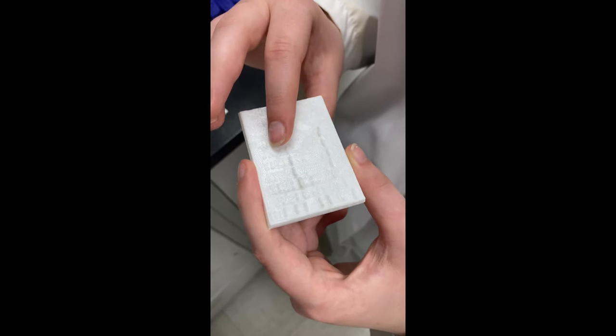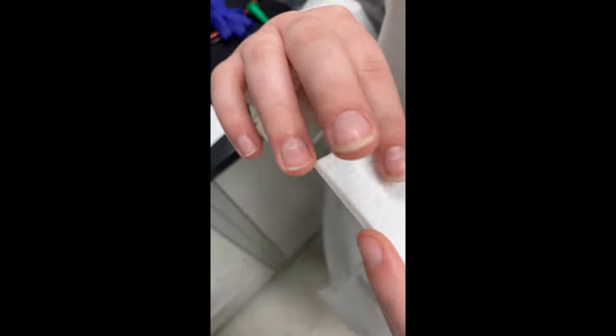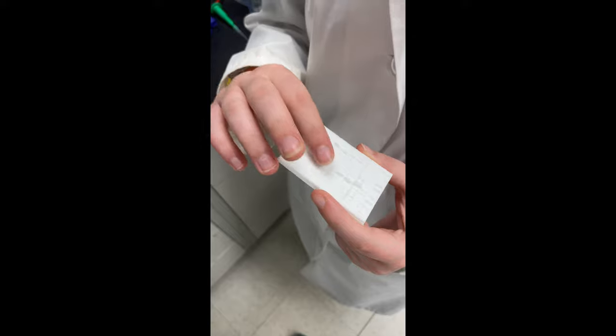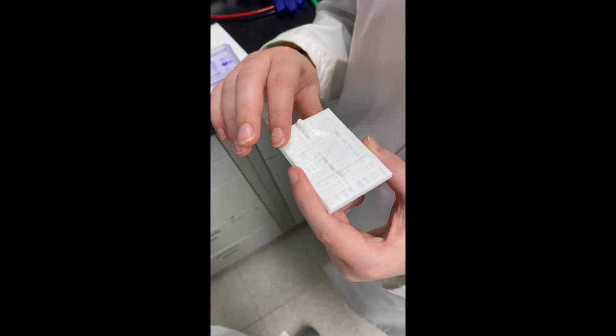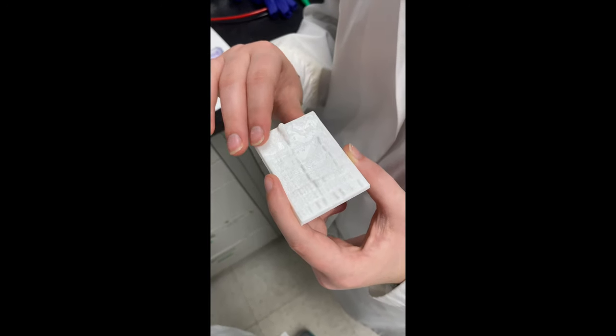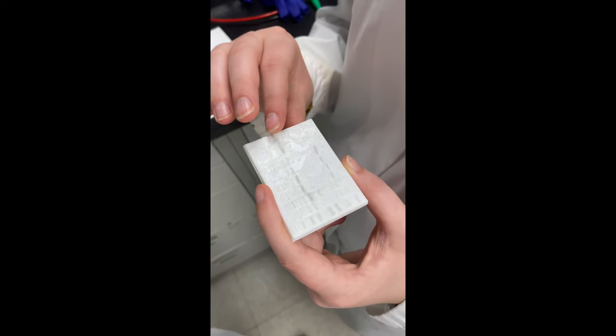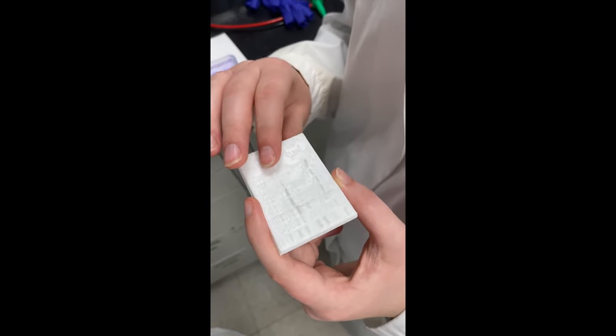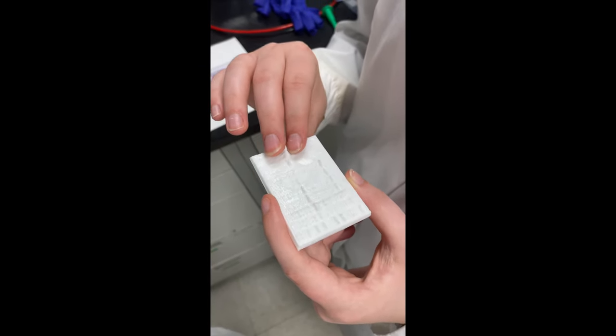As we go through each lane we're showing one purification process but all the different stages. Each stage we're trying to improve the purity of our sample. We only want to have this one band at a certain molecular weight because that's our protein of interest. We want to get rid of all the junk proteins. So as you move from left to right, you can feel that the junk bands start to go away and the band of interest gets bigger and bigger. That's what this is. That's cool.